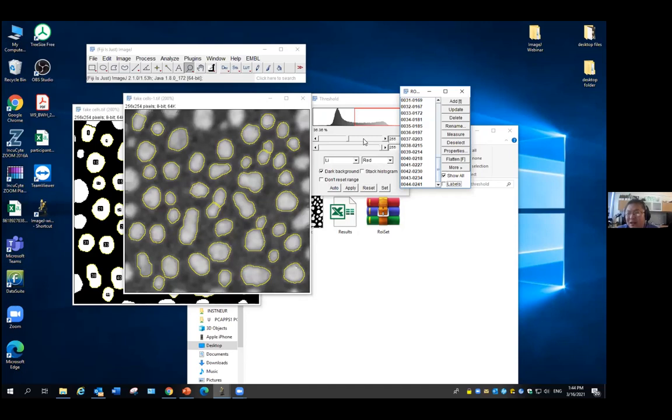When we analyze our images, most likely you want to compare two different conditions. To make sure you can actually compare them, you have to make sure they are treated the same. Then the difference showing up is actually coming from the sample itself. It's not from some other different choice you used to analyze the image. Consistency is much more important than getting an ideal perfect result on a single image.